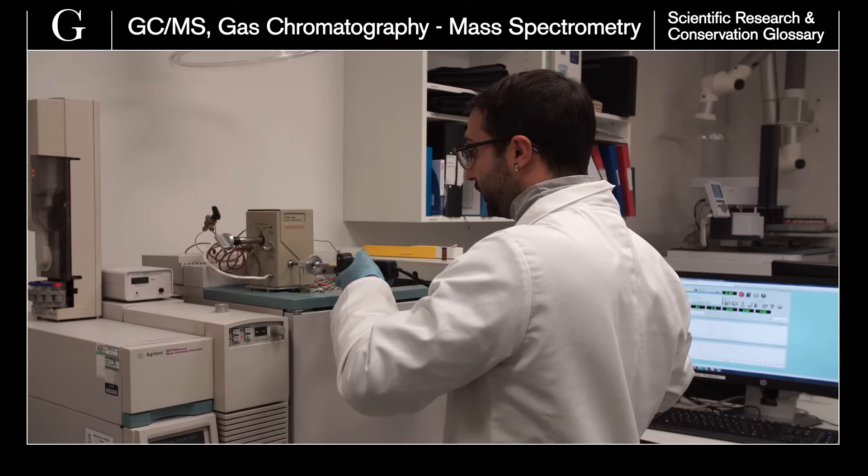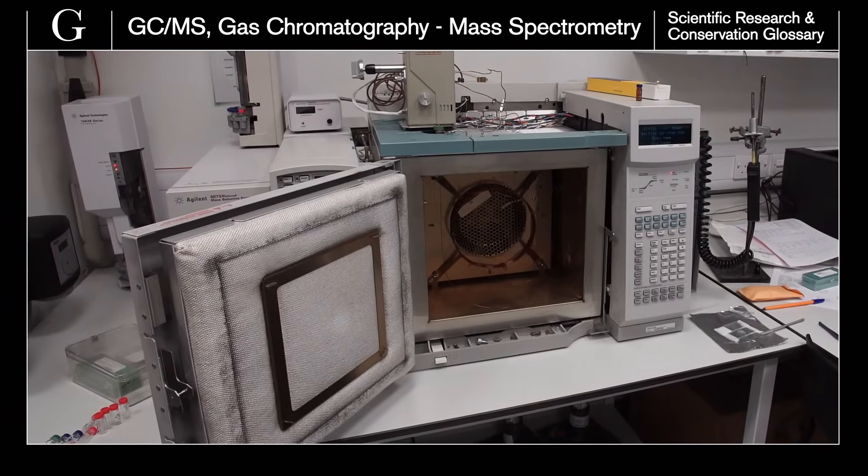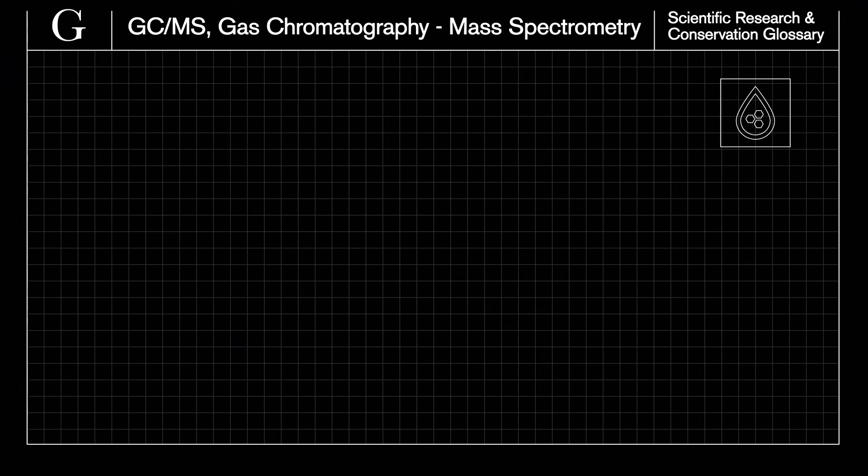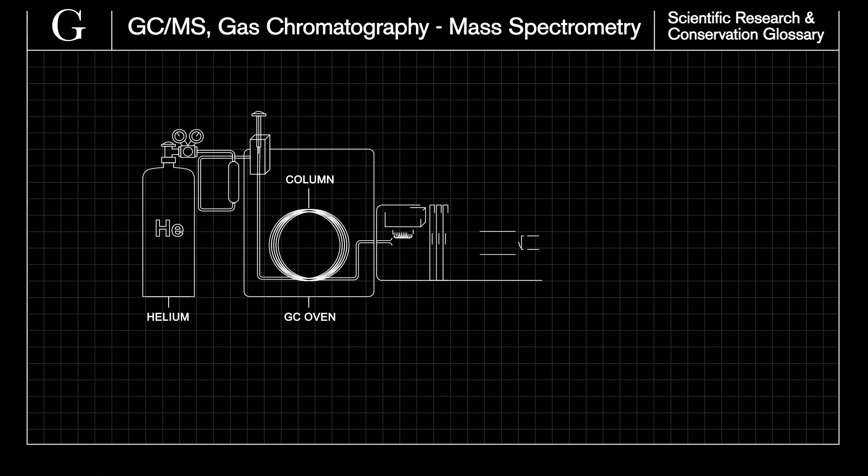Gas chromatography mass spectrometry is used to identify resins, fats, and waxes. A minute sample is dissolved and injected into the chromatograph, which is an oven containing a polymer-coated column. The samples move through a stream of helium gas and emerge into a detector, which produces a chromatogram.